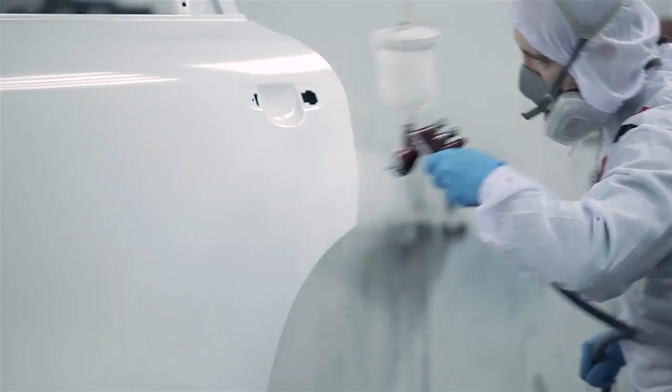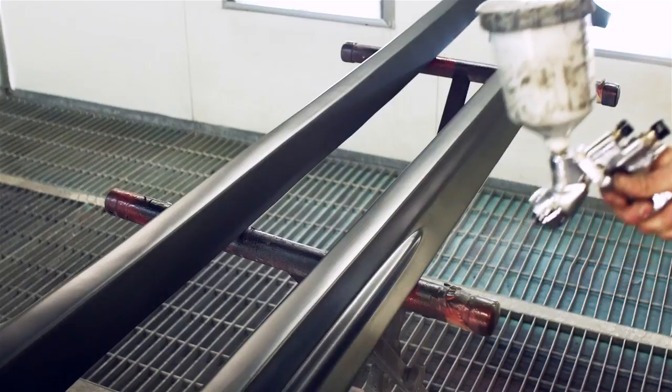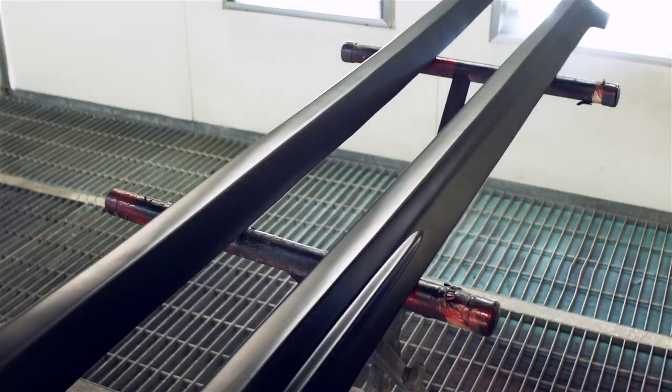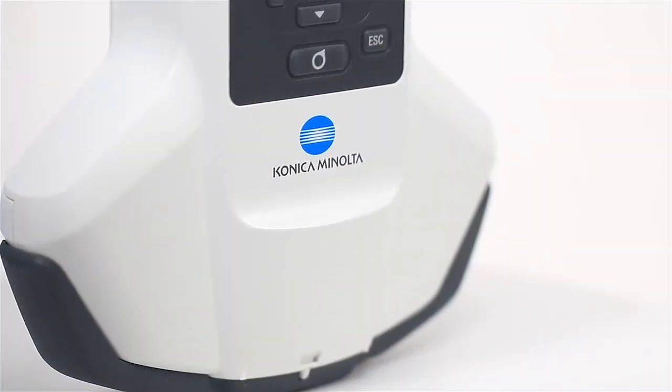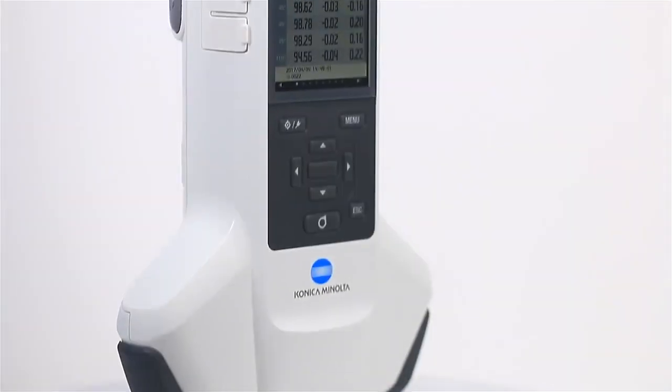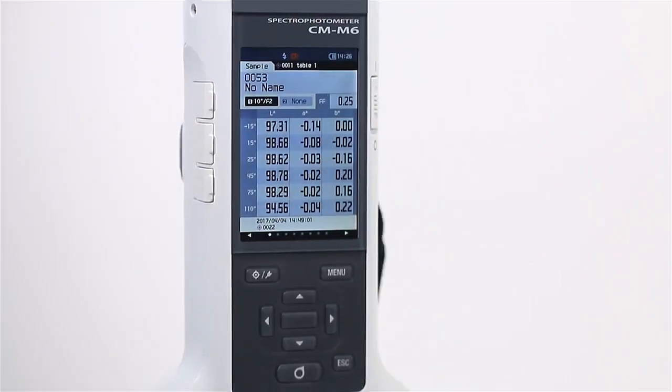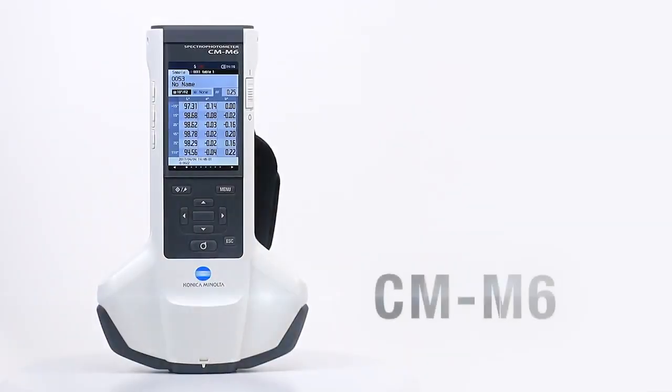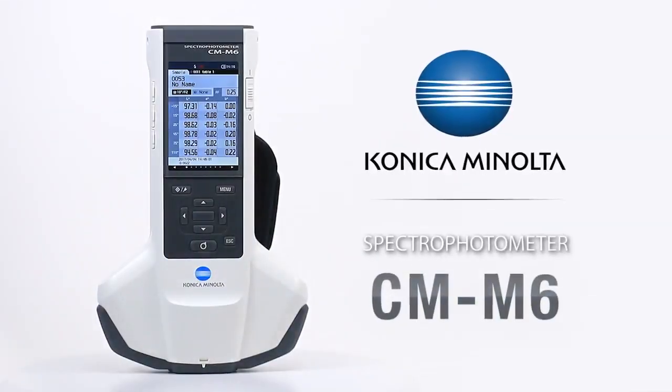As the color of paints and coatings become more complex, it is important that brightness and other color-related standards remain consistent. With this in mind, Konica Minolta Sensing designed the handheld spectrophotometer CM-M6.